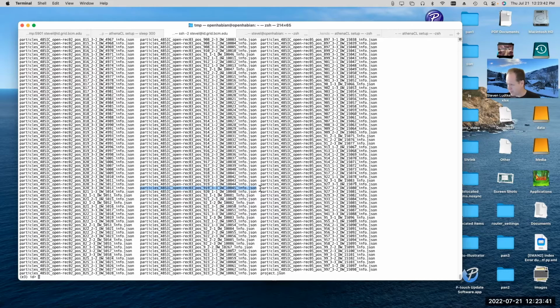You can see there's basically one of these JSON files for each micrograph. The other file format that you'll see being used sometimes in this field and other fields, that the PDB also uses, is XML. XML was designed to be a human readable format, but XML files are really long and convoluted, and they're annoying to read. JSON was a somewhat newer alternative to the XML file format, which is written in JavaScript.